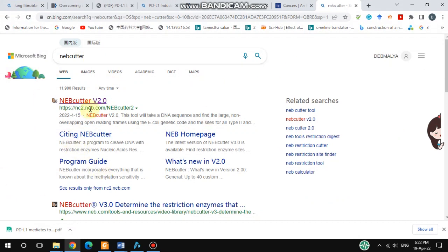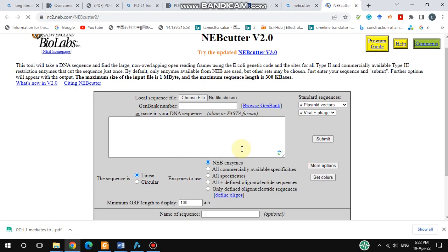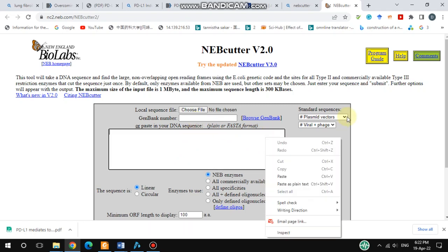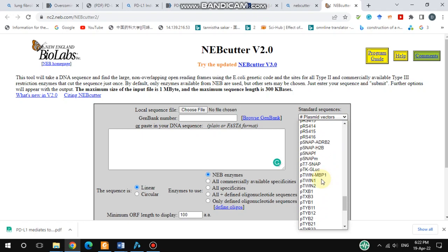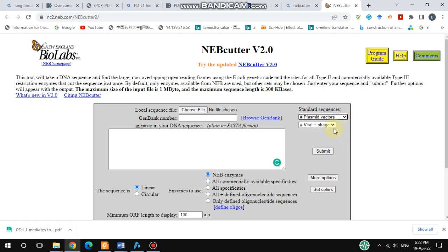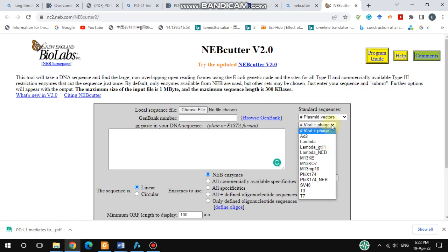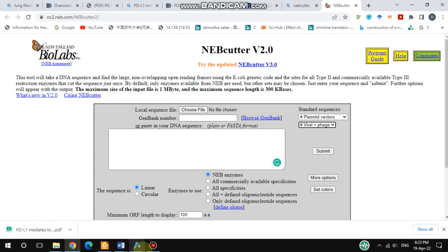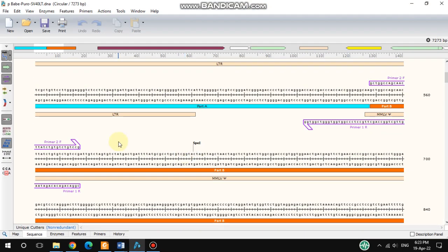To use NEBcutter, open the tool and you will see this kind of interface. Here you have to paste your desired sequence, or you can choose a file. There are also different options including different vectors and sequence types — viral and other kinds — so you can choose from here.